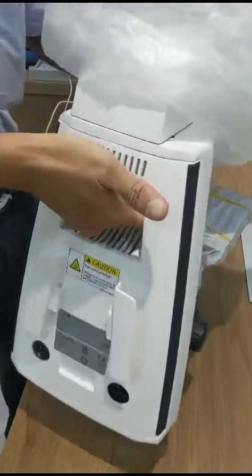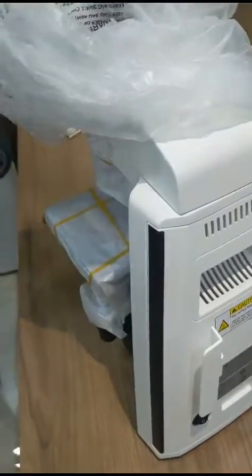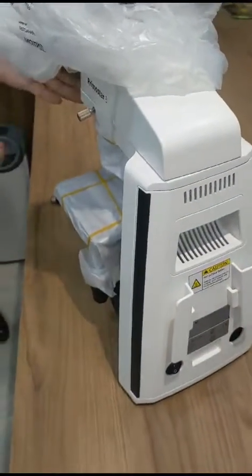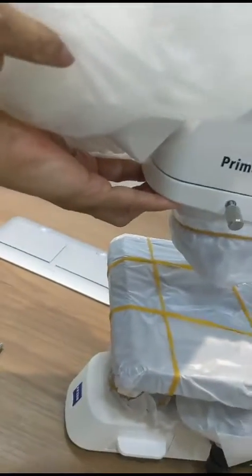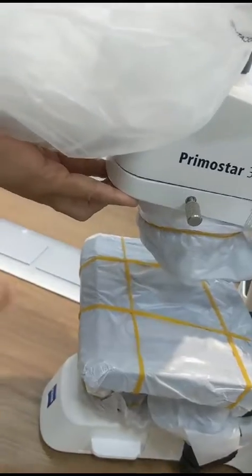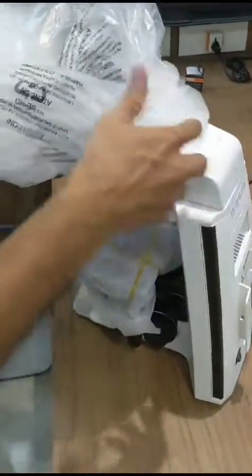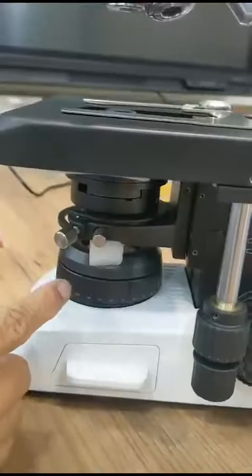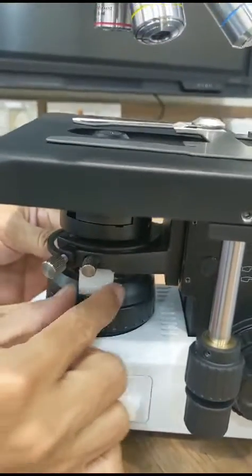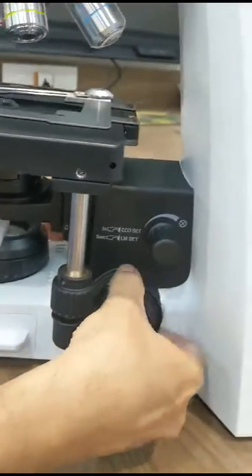Hold the microscope at the handle with your right hand and put your left hand in this position and lift it wherever you want to place the microscope. Keep it on the table and remove the trinocular tube.